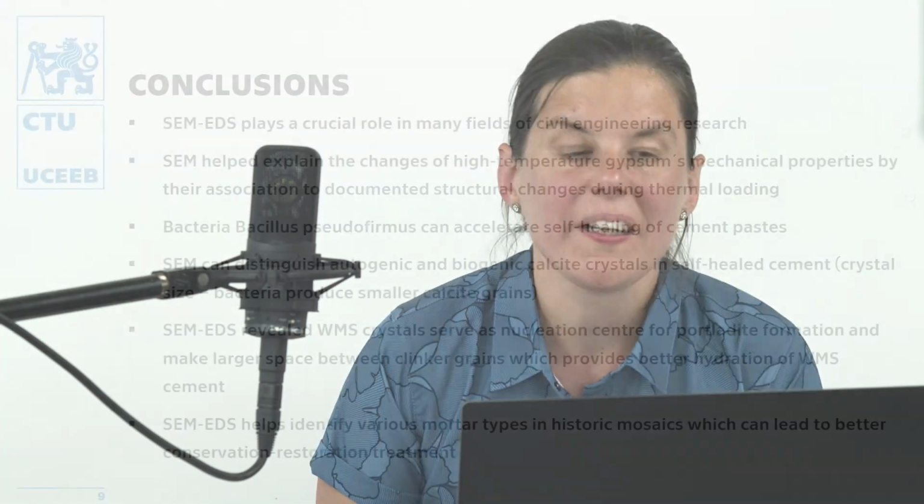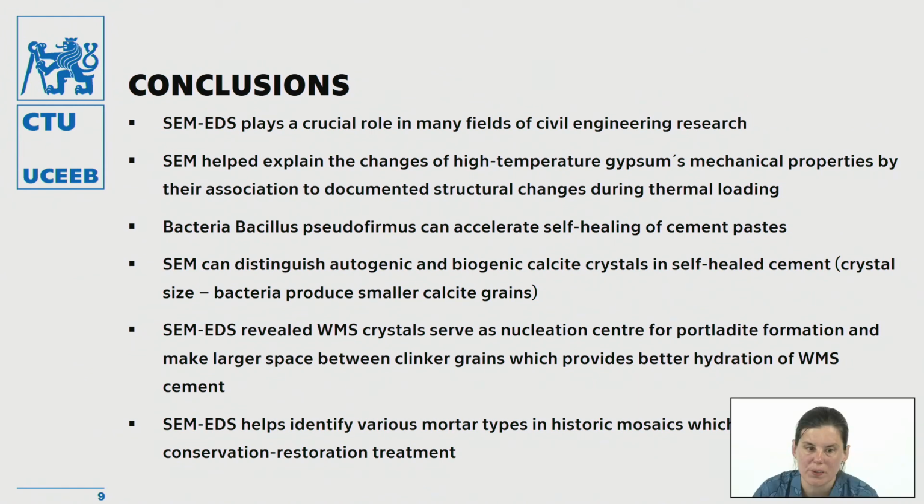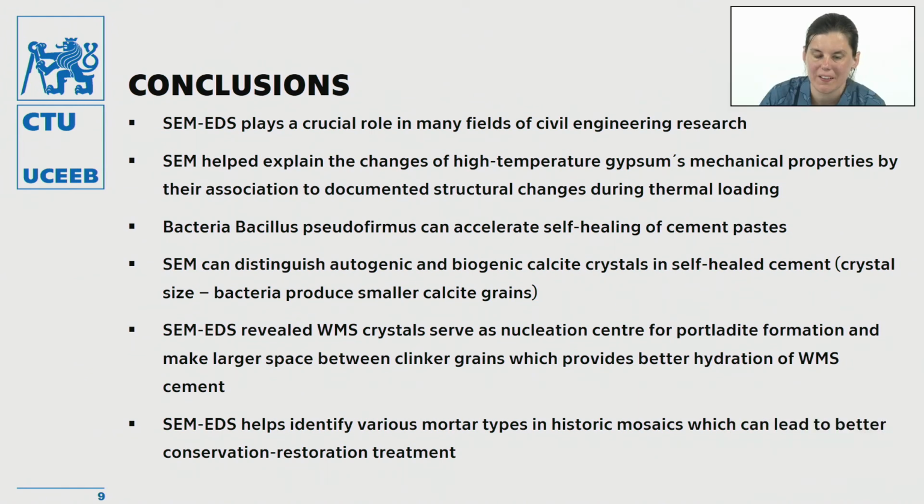So, to conclude, scanning electron microscopy is a very powerful tool for the analysis of microstructures and elemental composition of building materials. I think we reached quite interesting results.